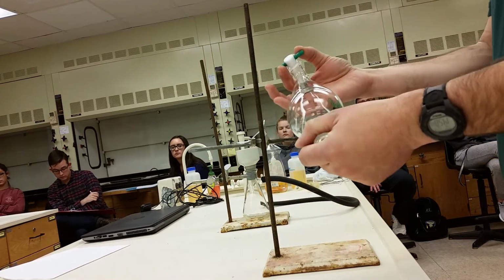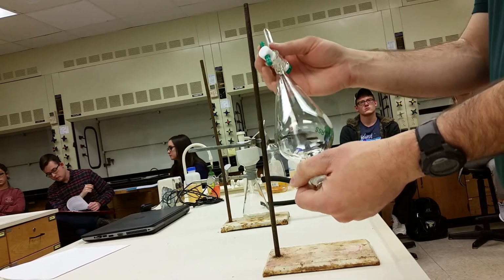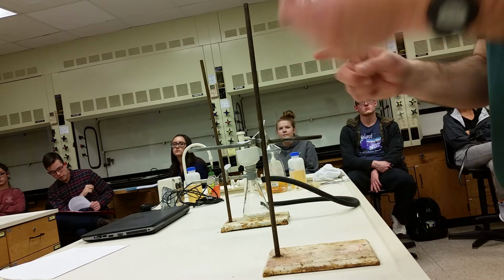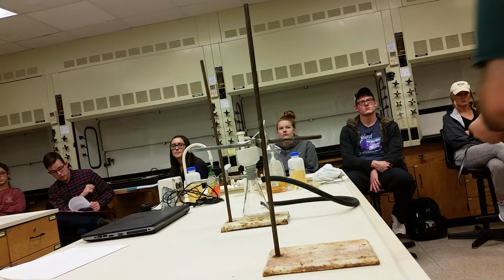You need to vent. To vent, turn the stopcock parallel to the stem. That allows you to vent. To do this, though, you need to be in the hood.